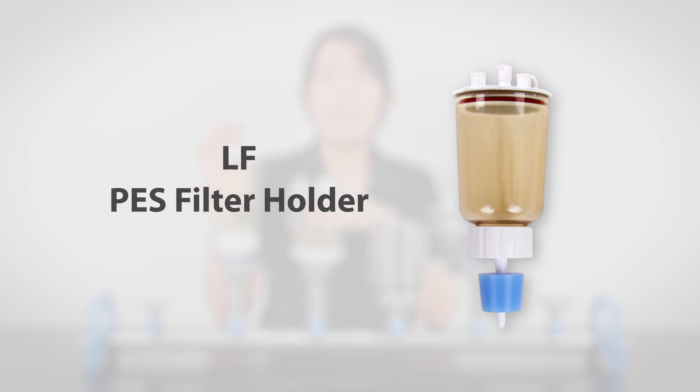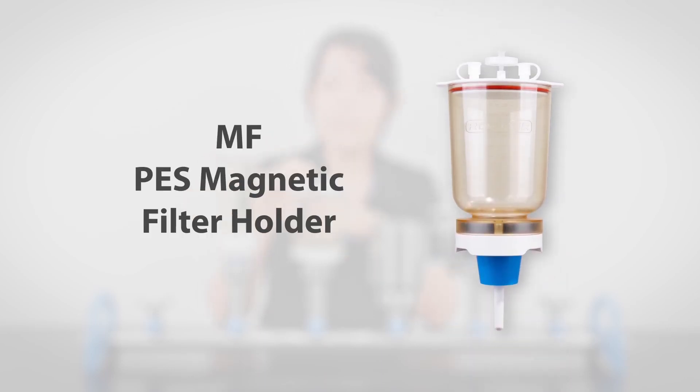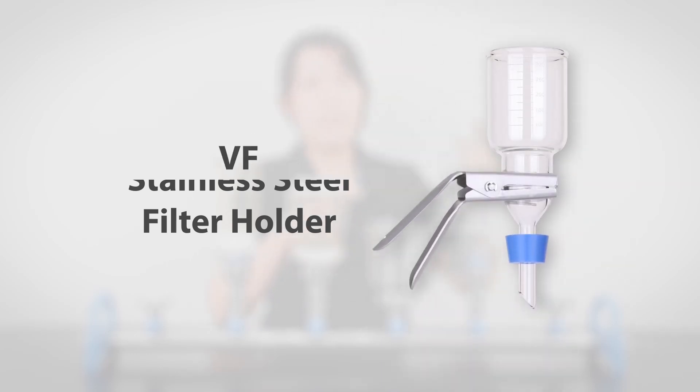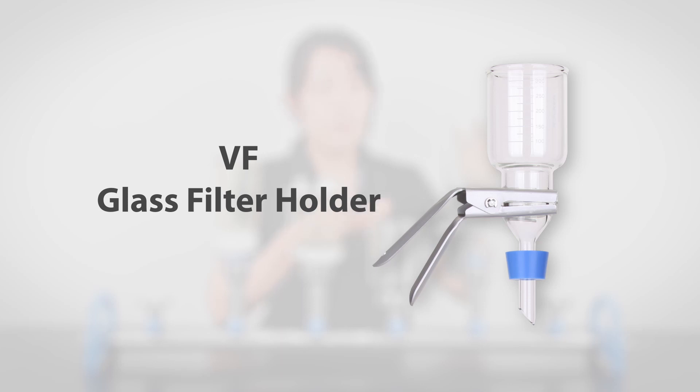First is the LF collection. This is a classic collection from Rocker with our first generation of spin-locking design. Second is the MF collection. The M stands for magnetic steel, and this award-winning holder is famous for being handy and durable. Third is the SF design — the S stands for stainless steel, and it's made of 316 stainless steel. Then there is the VF, another classic collection from Rocker that's made of borosilicate glass, which is more durable against chemicals and heat.